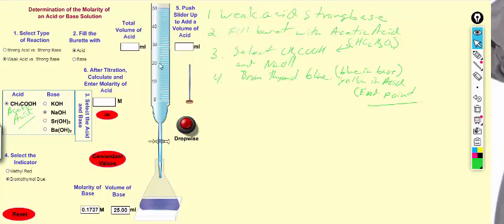Then you can go ahead and do the 2nd titration. You should get numbers that are similar to the first, because the volume and molarity of the base, these known values, are the same. The unknown, right, this is what we're determining here. What we're determining is the unknown acid concentration. So we know it's acetic acid, but what we don't know is the concentration.